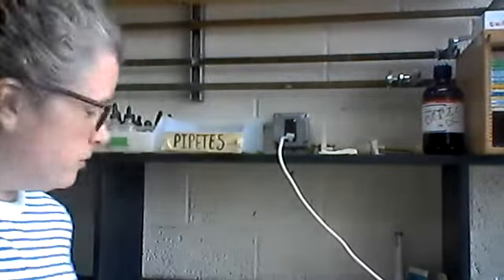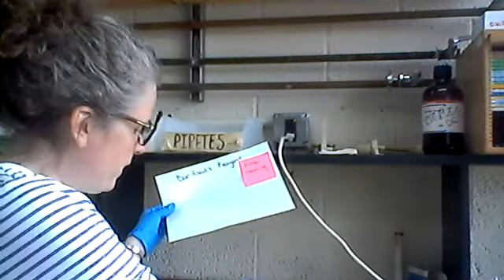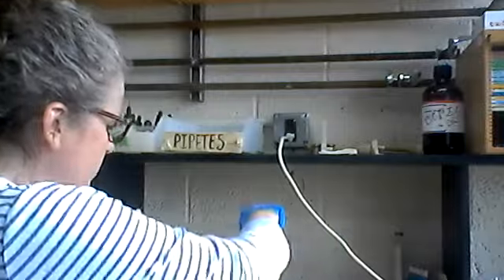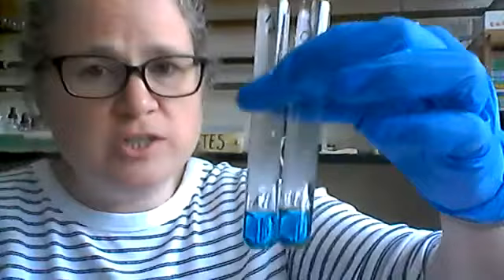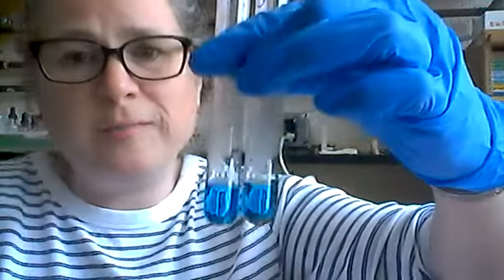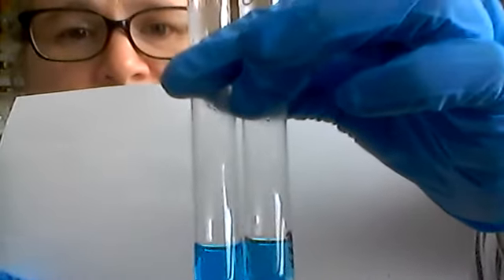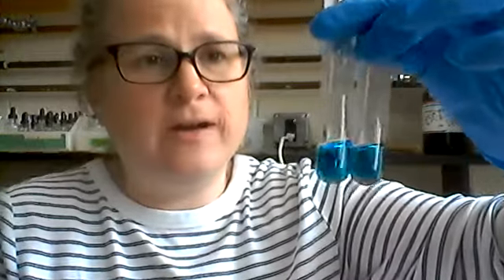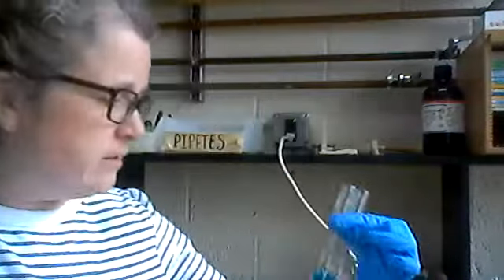Okay, so I just pulled our Barfoed's reagent out of the boiling water bath. It's been 10 minutes. And essentially what you're looking for, some of them will have not really changed at all, like number 1 here, that's the water, makes sense, it's not reacting with things. Some of them will have this kind of reddish precipitate at the bottom, and that indicates the presence of monosaccharides. And the more of that precipitate, the more monosaccharides there are in the substance. So I'm going to go through and take photos of these, and I'll come back and show you the rest.